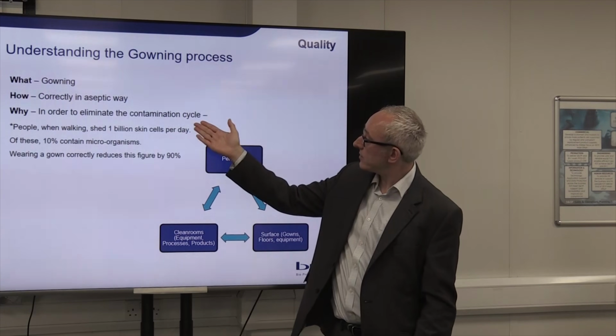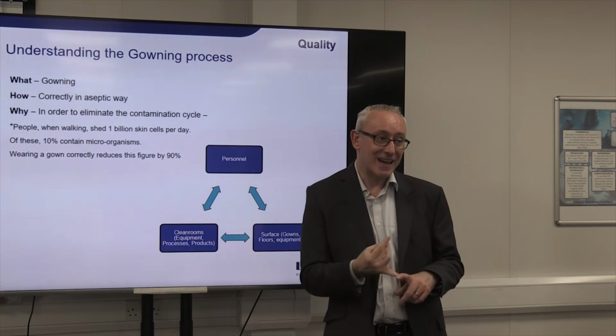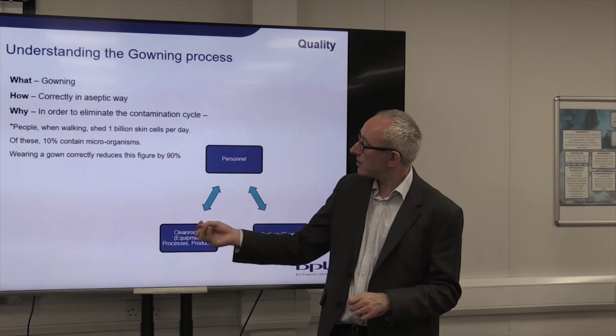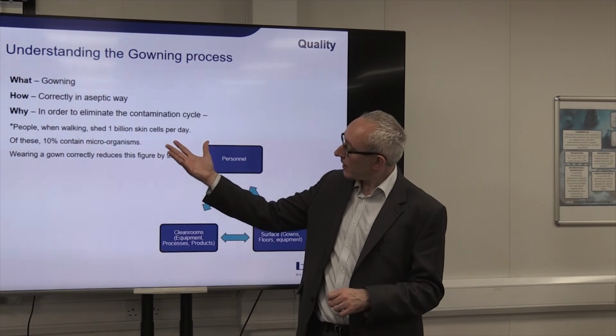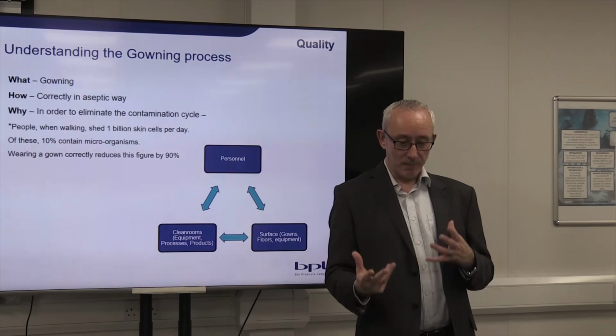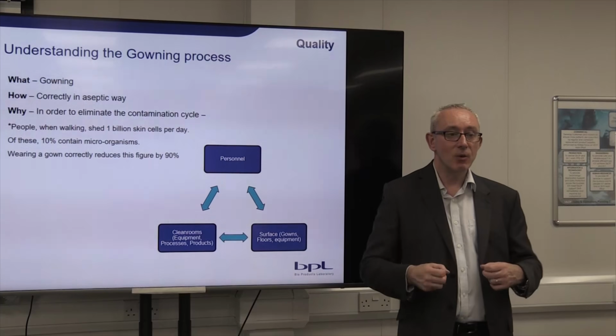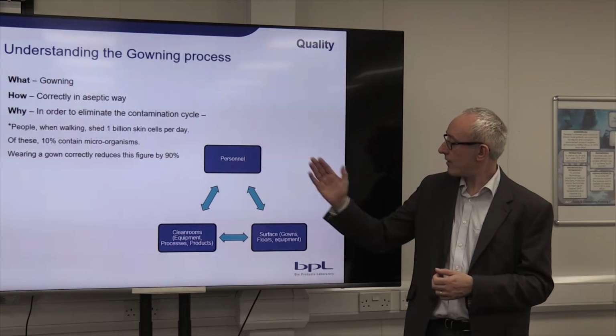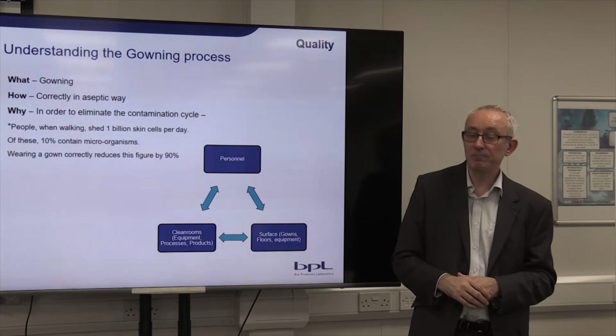And one reason to do that is, one, you don't want to add any extra contamination to the suit, and two, if you're getting gowned in a haphazard way and it's quite a frenetic activity, then you don't want to be shedding more and adding to that contamination risk. So practicing gowning is very important.